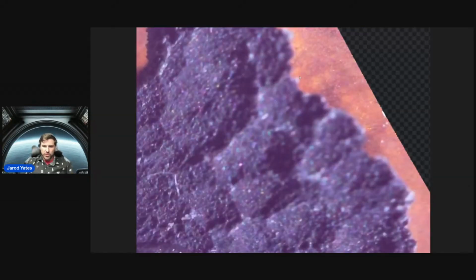All right, here's a picture that I have skewed for good purposes here from the first talk. There was something on the bismuth side of the sample that really caught our attention. I think that's on the bismuth side. Maybe it's on the magnesium side. No, it's on the bismuth side. Anyways, this little 90-degree fiber thing here. We were really curious what's going on with this. We're like, is it a hair? Is it a piece of polyester? Is it purposeful and part of the sample? What's going on with that?